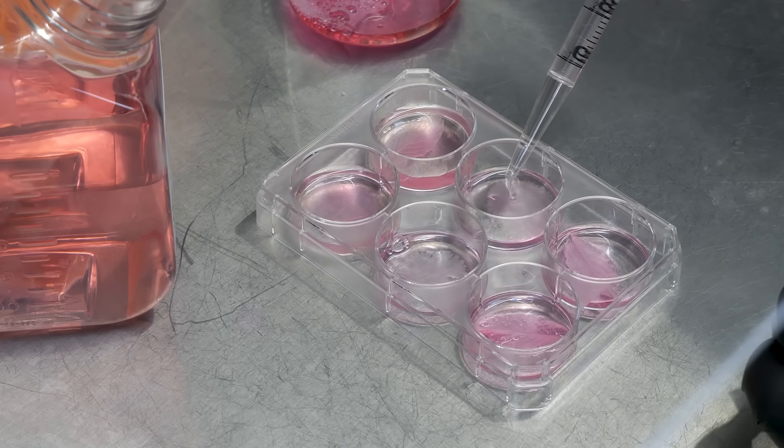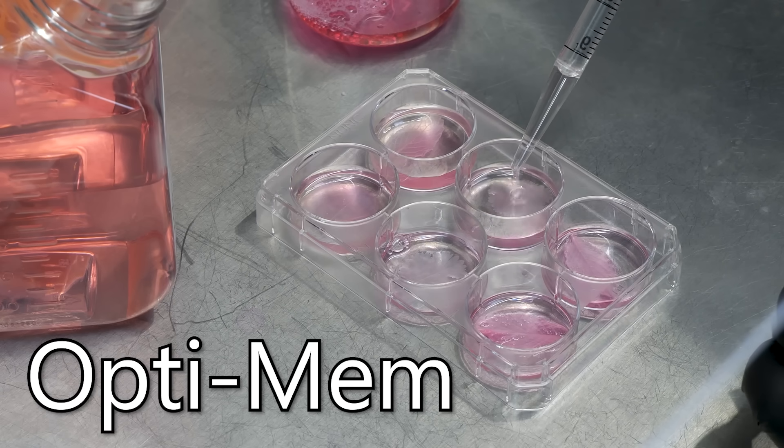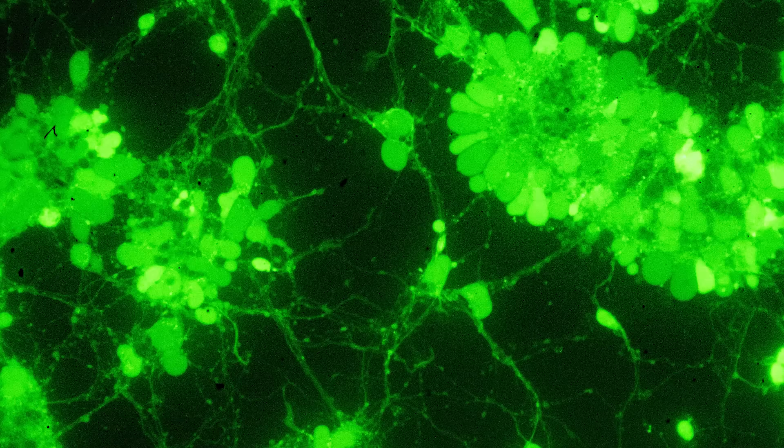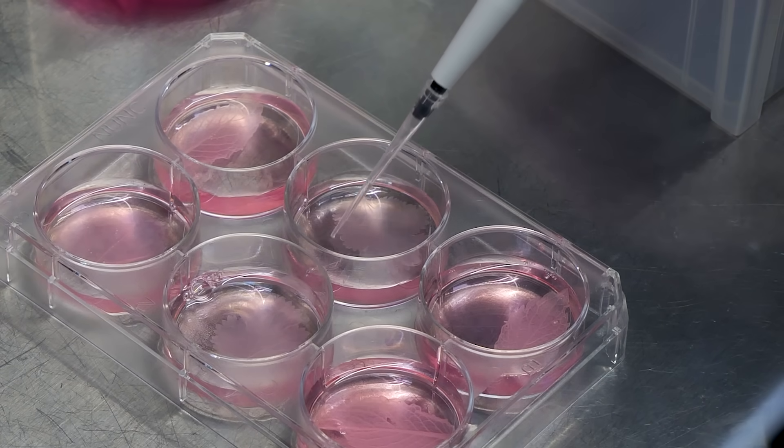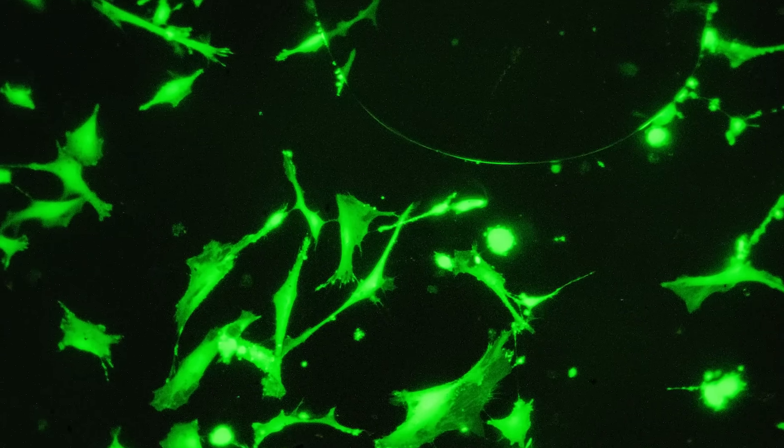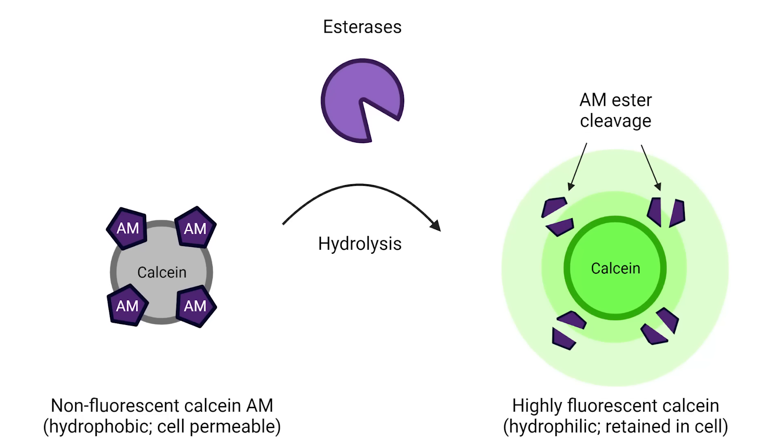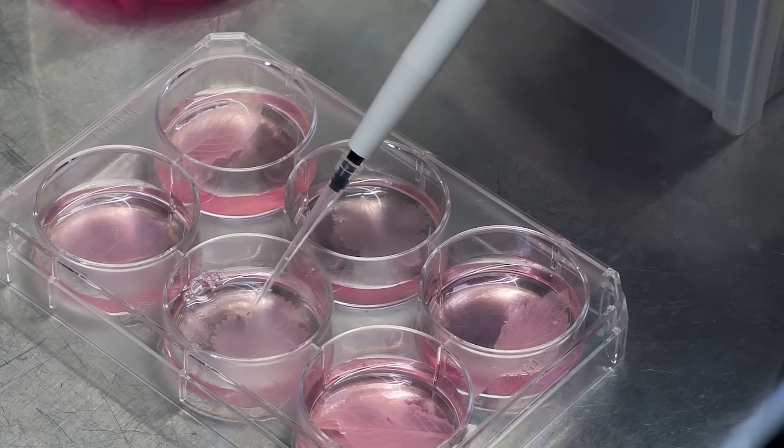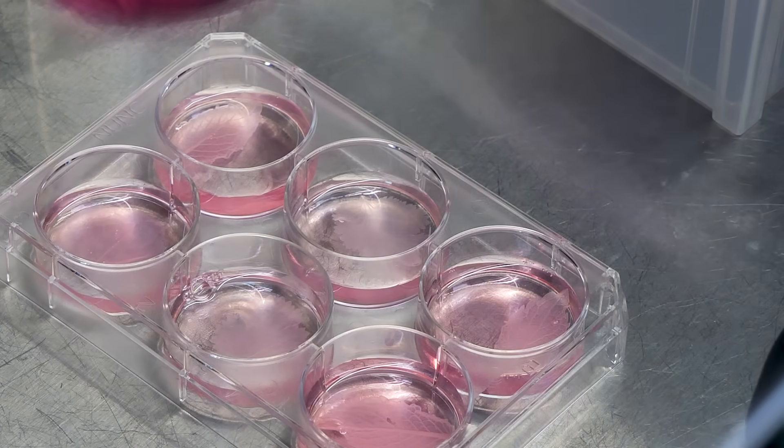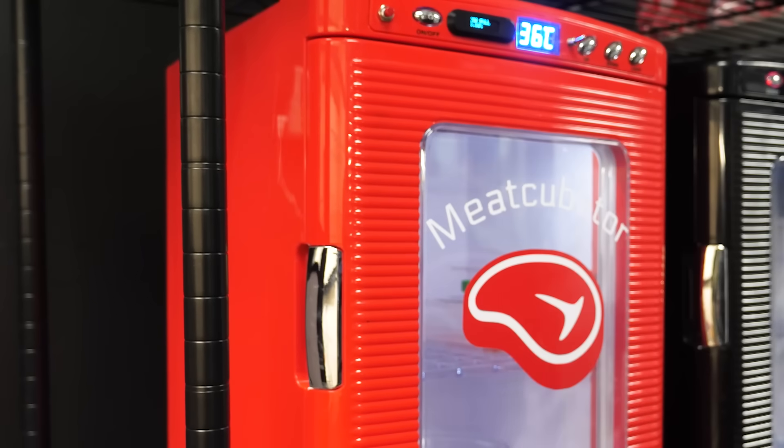So, the next day, I changed out the media for one called OptiMem, which is a serum-free media. The stain we're going to use is called Calcein-AM. It's a green fluorescent stain, but it starts as a non-fluorescent clear liquid. The idea is that if a cell is healthy, it'll uptake the dye, and then through enzymatic action, cleave part of the dye off, converting it into a fluorescent state. If the cells are dead, nothing will happen, so they won't glow. So, not only will this show us the cells, it's also an indicator of how healthy they are. I add 7.5 microliters of stain to each well, and then let the plate sit in the meat incubator for 30 minutes to give the cells enough time to uptake and process the dye.